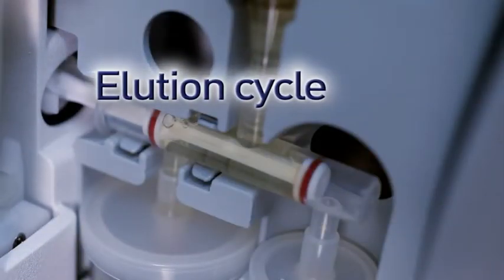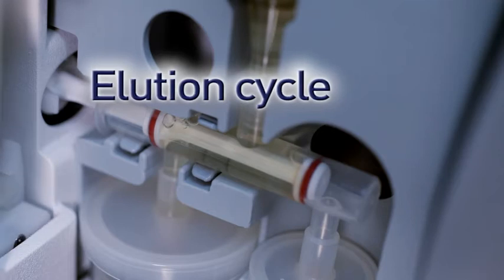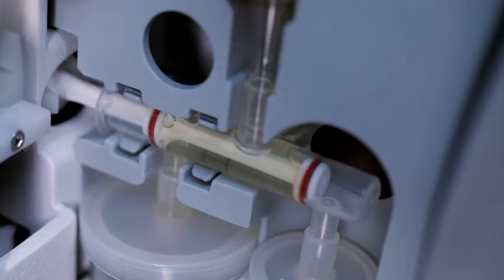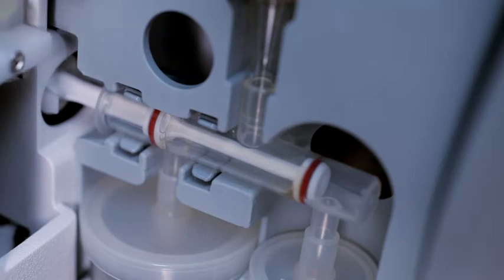During elution, PBS is flushed over the capture chamber, washing the beads. The bead suspension is expelled and drained, and the auto beads are drawn to the magnet.